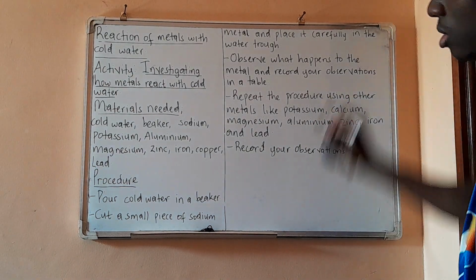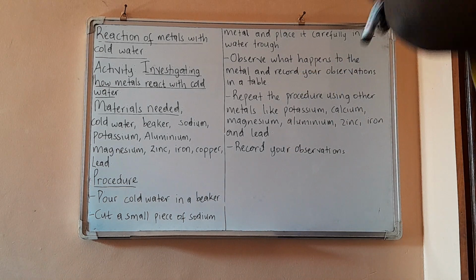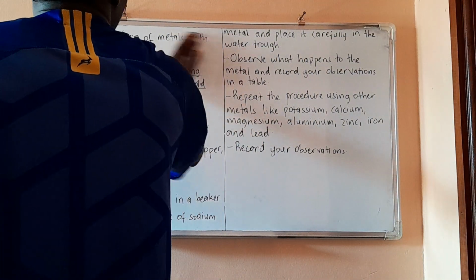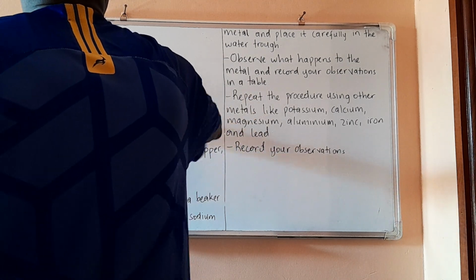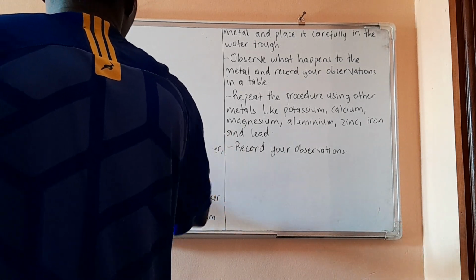Then you record your observations in a table. This is the experiment. Now we are going to proceed with the observations.